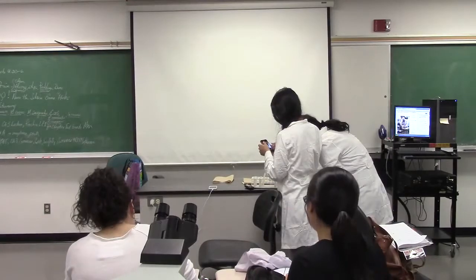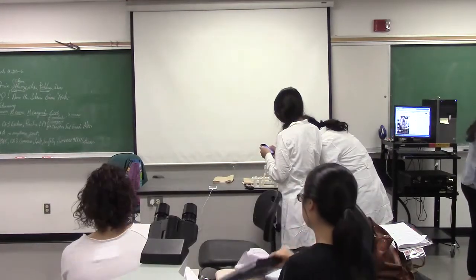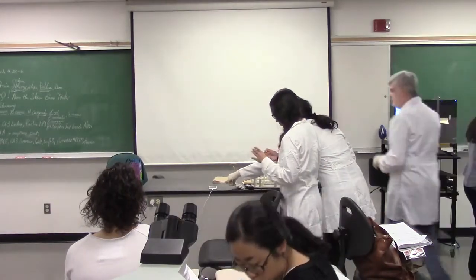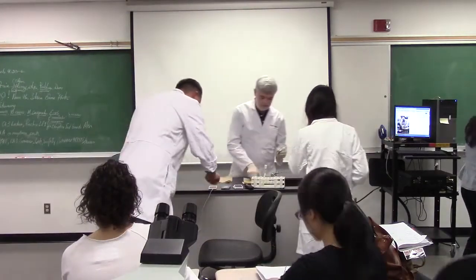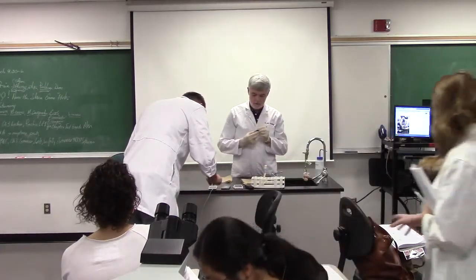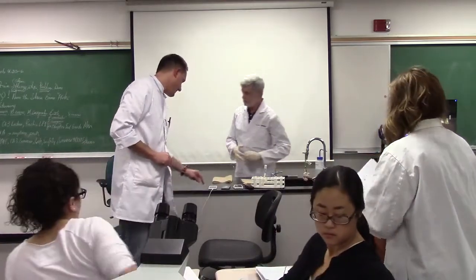So tonight's the Endospore stain. Is it going already? Yeah, I went ahead and turned it on. I'm going to go over several things with you, like the agenda, and we're going to do everything Endospore tonight.